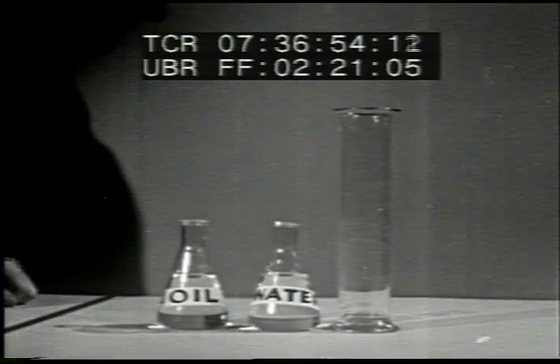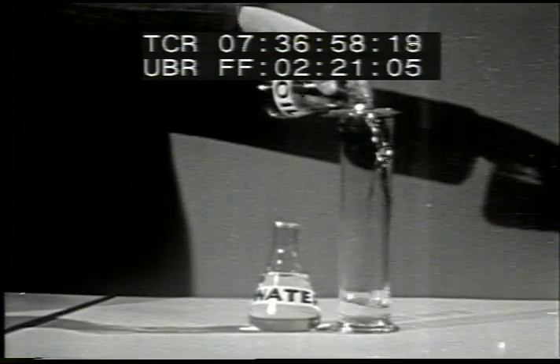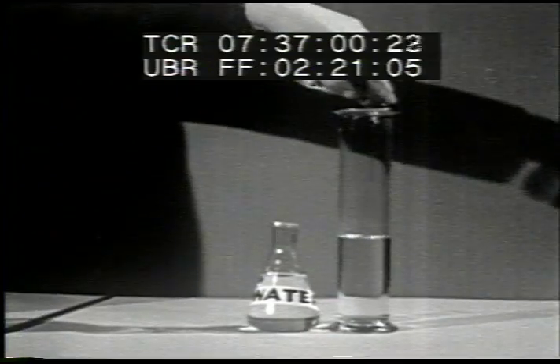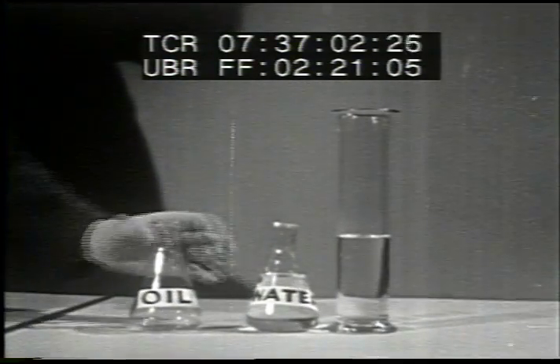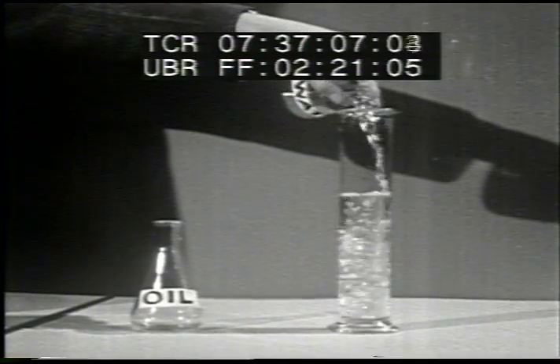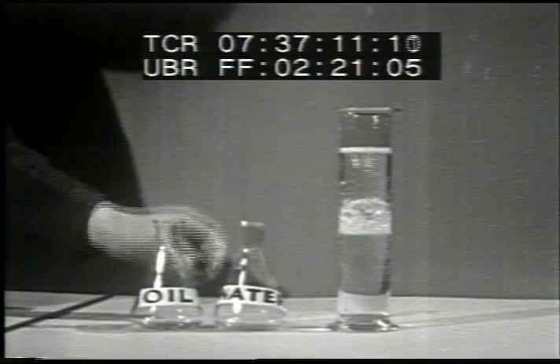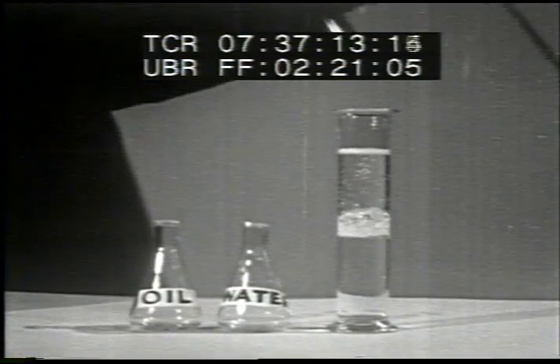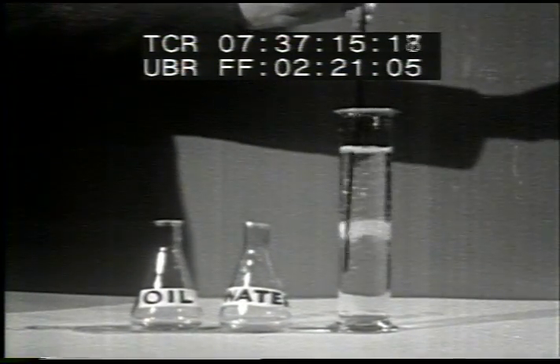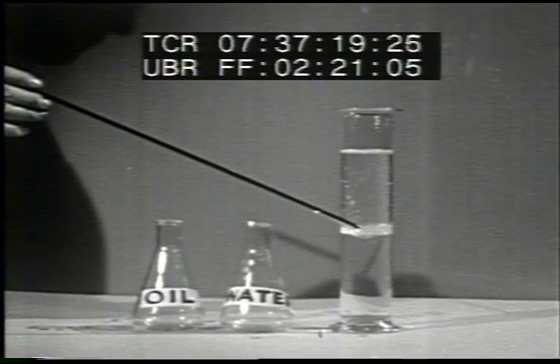Not all liquids, however, behave in the same manner. Let us pour some oil into this cylinder. Now, we add water to the oil in the cylinder and observe that the results this time are quite different. The liquids do not mix. Layers are formed that persist even though the mixture is stirred. Liquids which are not soluble in each other are said to be immiscible.